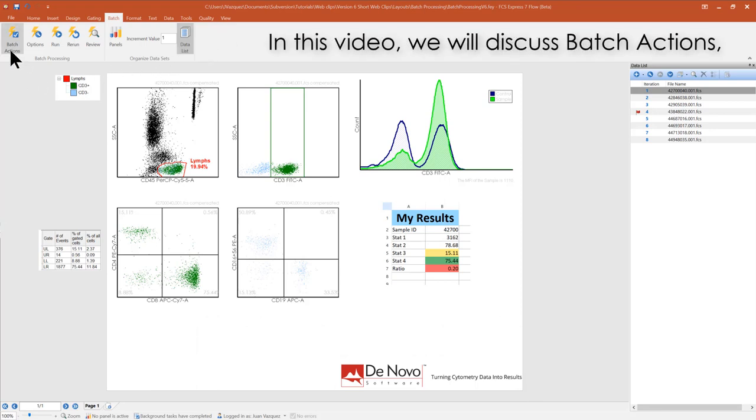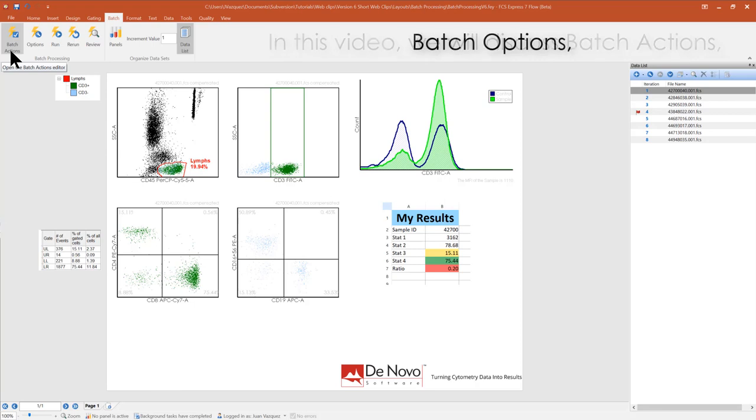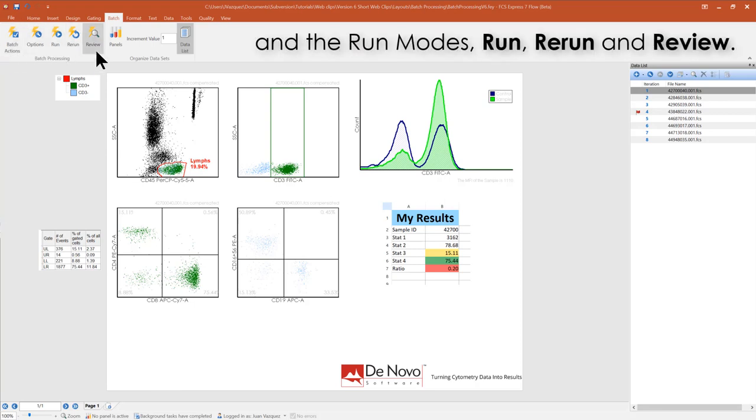In this video, we will discuss the Batch Actions, the Batch Options, and the Run modes: Run, Rerun, and Review.